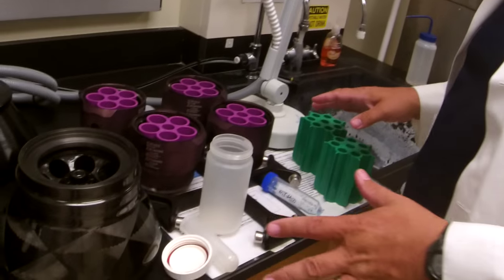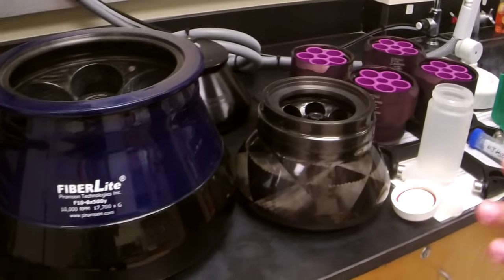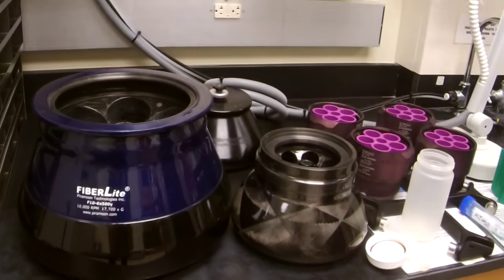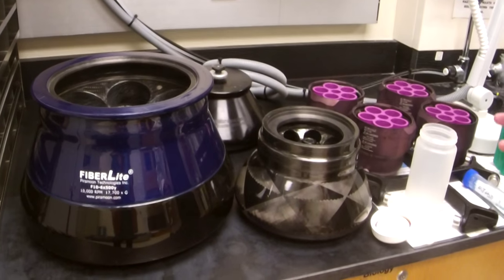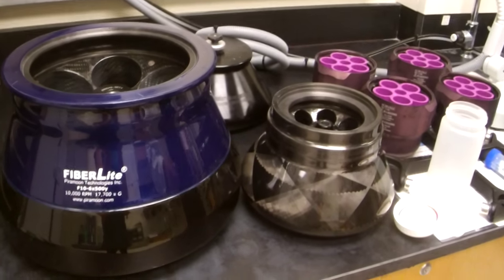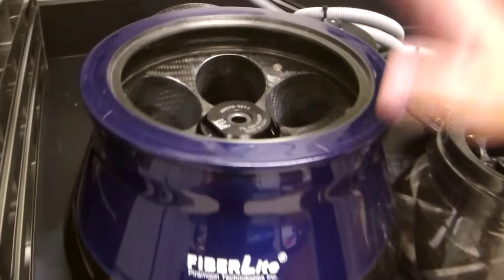Here at the University of San Diego we have a number of different centrifuge heads available for use. These have been supplied by budgets from the Department of Chemistry and Biochemistry, Biology, and Physics. So it's important you take care of these — they are shared pieces of equipment.